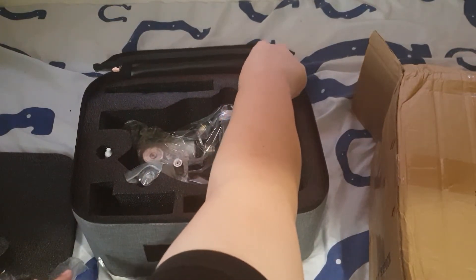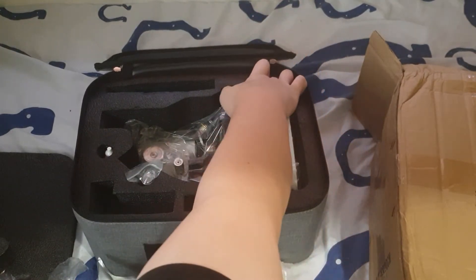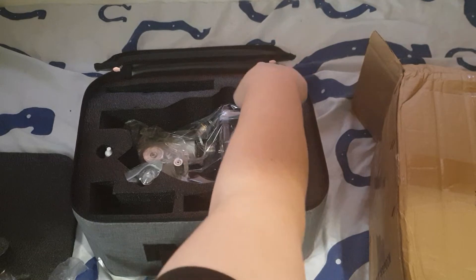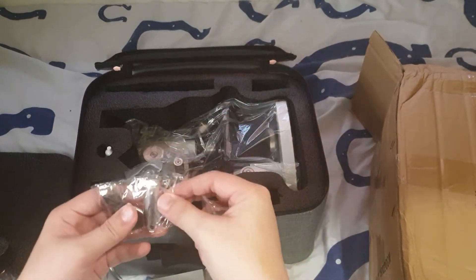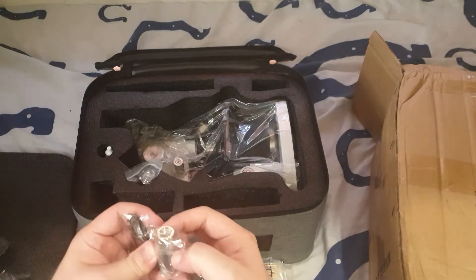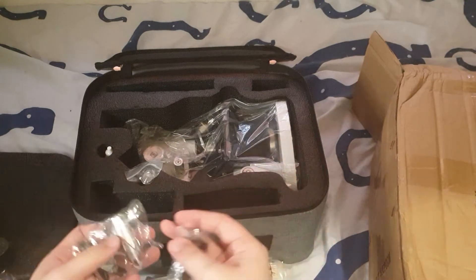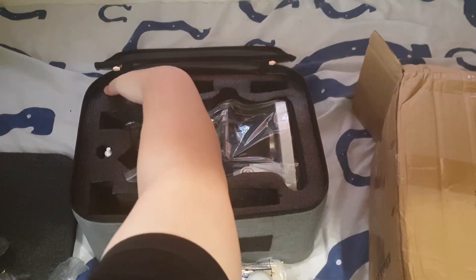What else do we have here? You've got eyepieces — you've got two of them. This is a lamp, an upper edge lamp. And you're supposed to have two lamps, I think.